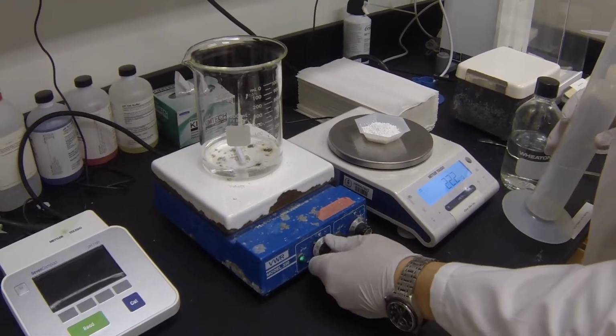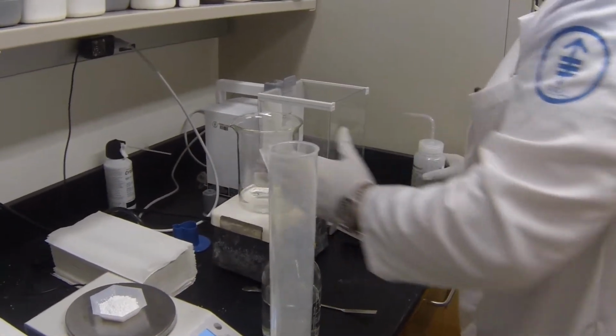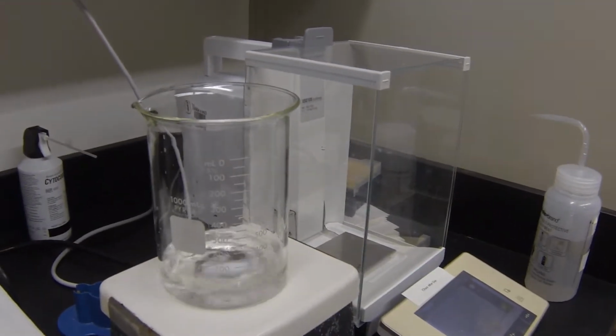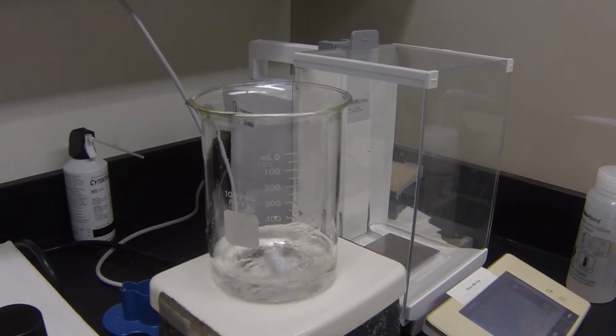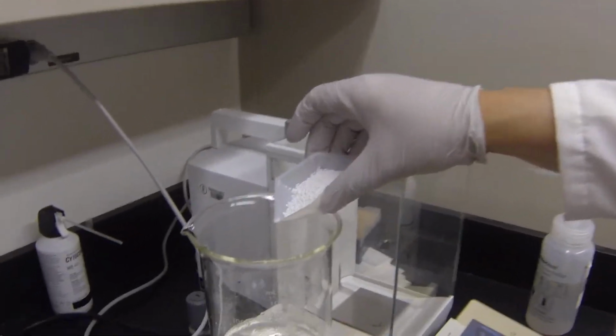Oh, this isn't even working. Oh no, this one works. Yeah, this one works. Perfect. Now it's going to start stirring, and it's stirring a little too violently. Let's lower it a little bit. You want to get a nice stir, non-violent. Then we're just going to pour our 22.2 grams right in there.